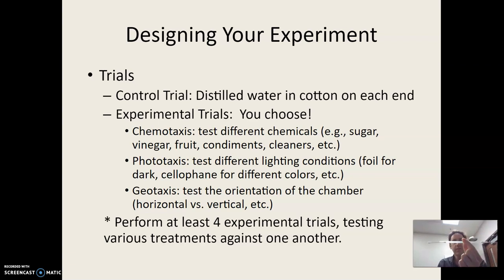So theoretically, there should be no preference either way for these fruit flies. It's really more, how do they just move around when there's no choice? So that's the purpose of the control.